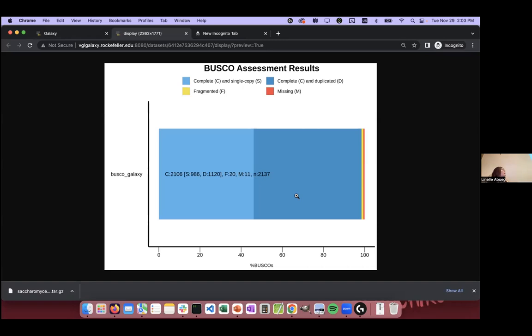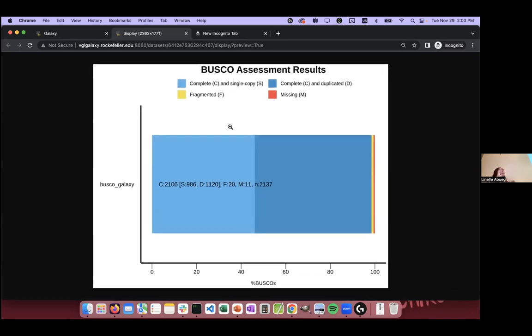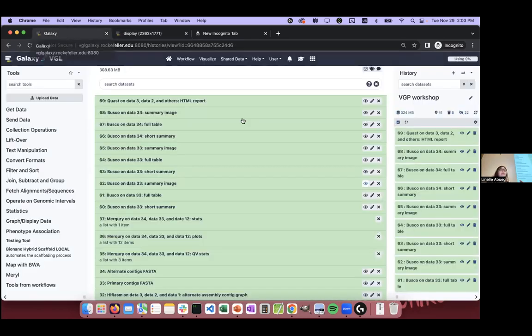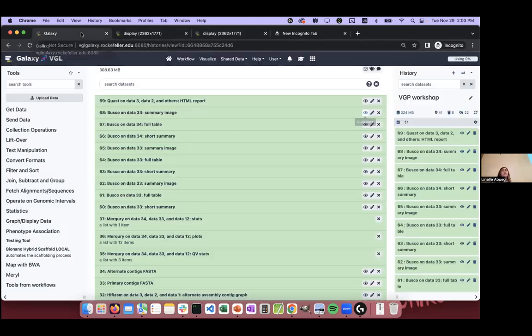So this is the primary that currently has, since we didn't do any of that purging, or not a lot of it, essentially 2 copies of the yeast genome in one assembly. Similarly, if you click on your BUSCO run for the alternate, there's a whole bunch missing because you just have 5 contigs that are haplotigs. They were so obvious that even HiFiasm's light purging was able to detect them and put them into alternate.